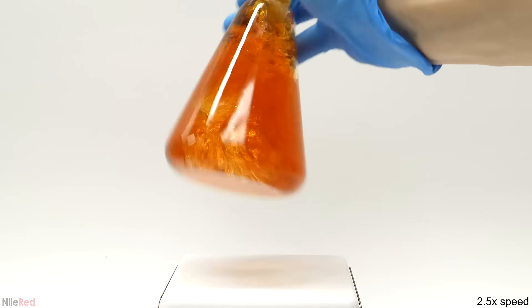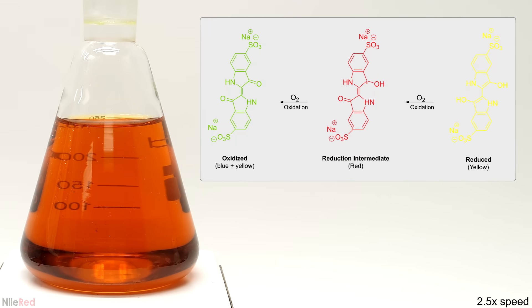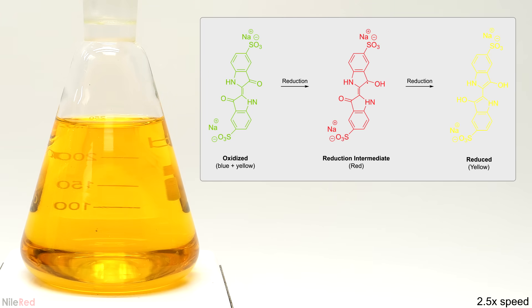Anyway now to change it back all I had to do was shake it which at first might seem kind of magical. However, it's not the motion itself that's making the change. It's a small amount of air that was still in the flask. By mixing things around some of the oxygen in the air gets dissolved into the solution and it re-oxidizes the indigo carmine all the way back to its blue form. The reduction reaction by the sugar is still going on though and it's competing with this oxidation. So the moment that I stop shaking it and introducing more oxygen the reduction side will win and it'll push it again towards the reduced yellow form.